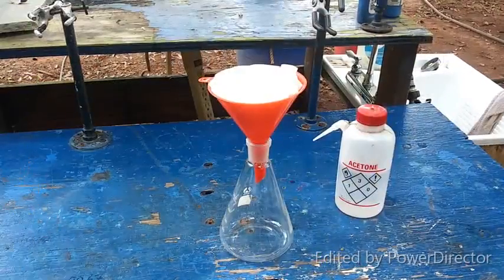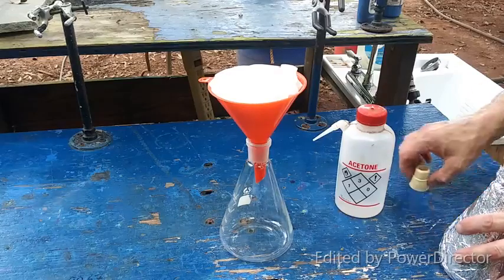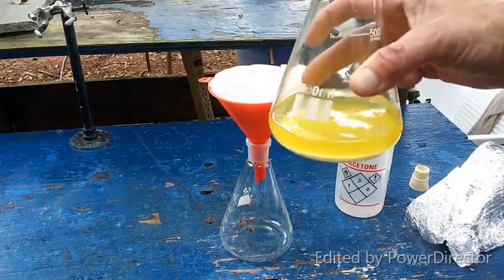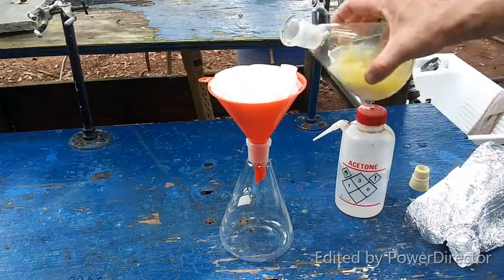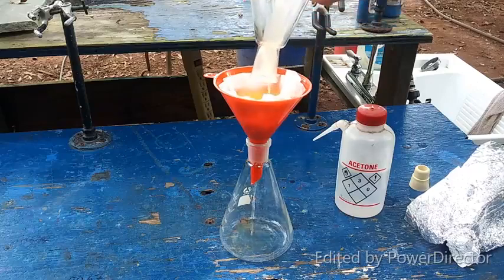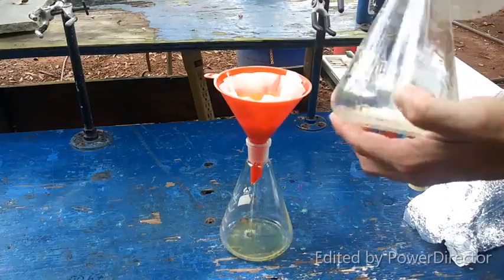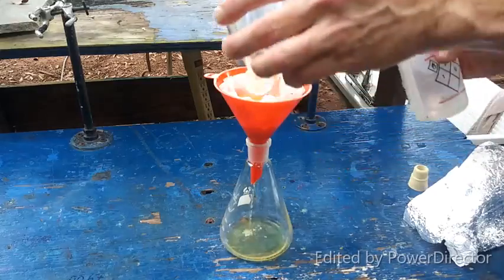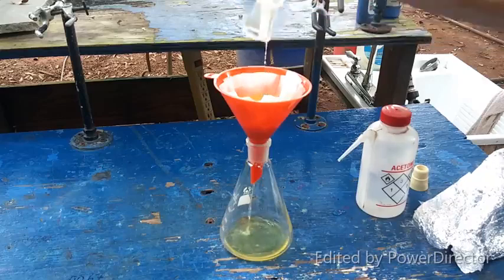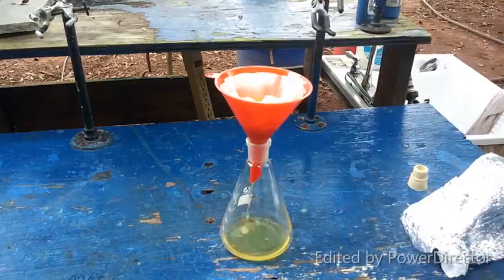Okay, everybody, so I distilled off quite a bit of the acetone earlier today, and then I had to go to work and let this sit here for a little bit, but you can see what we've got here. The yellow color is from iodine, I think. Pretty sure that's where it's coming from. You can see we've got a whole bunch more alkali halide, which is probably sodium iodide, given the excess of it that we used and how it appears to have dropped out of solution as the acetone was evaporated off.